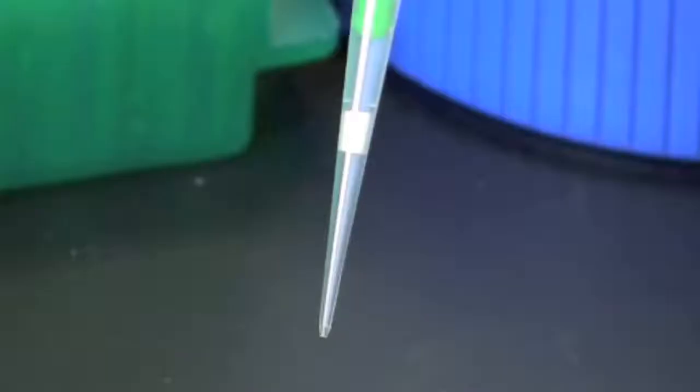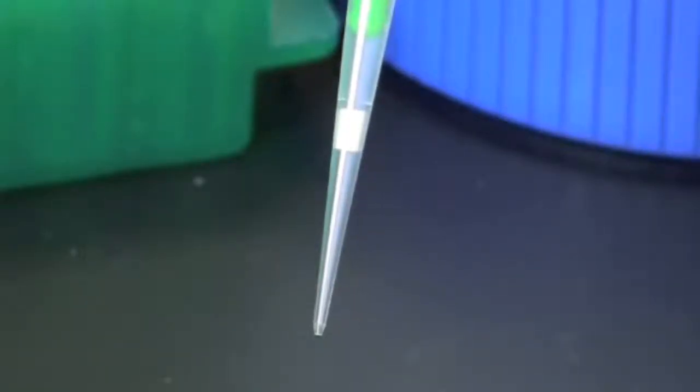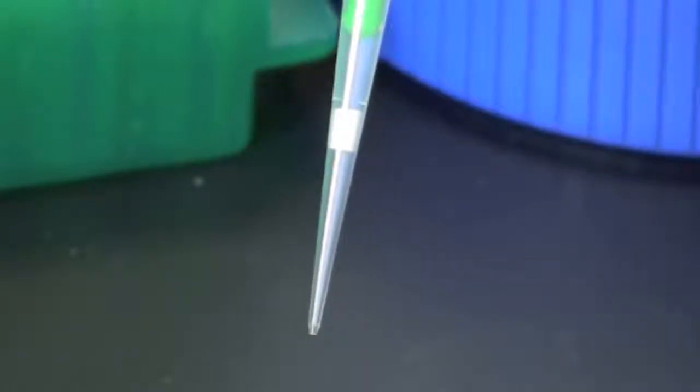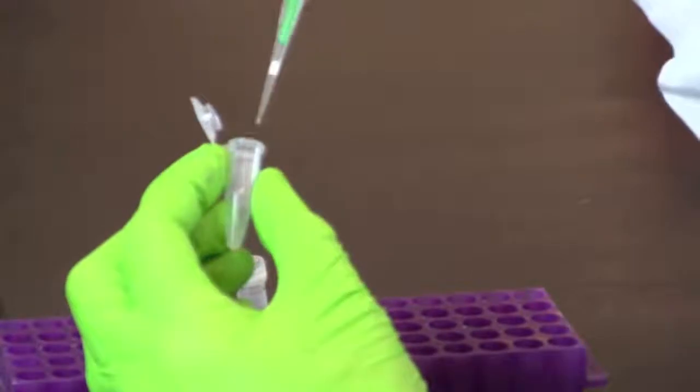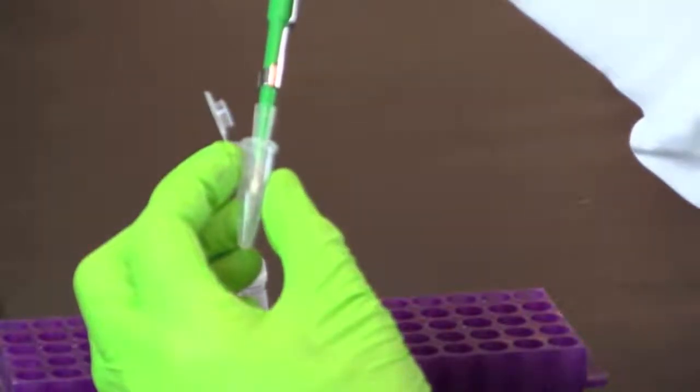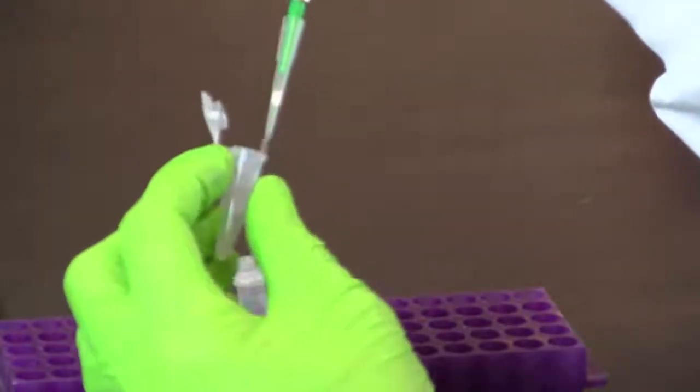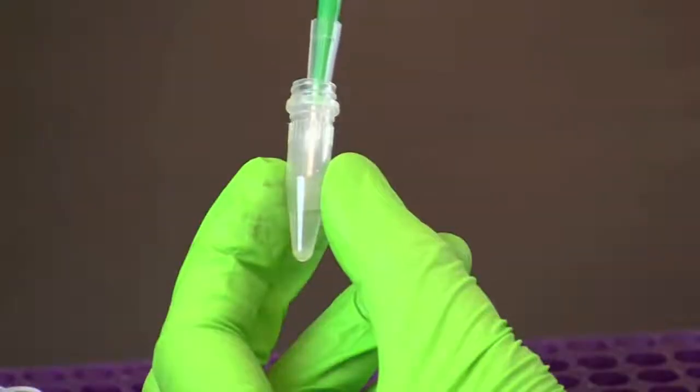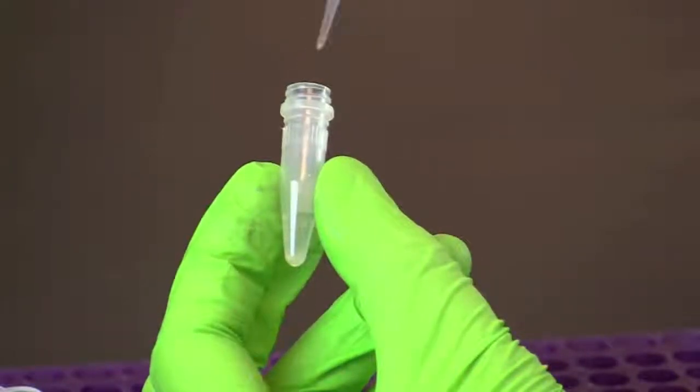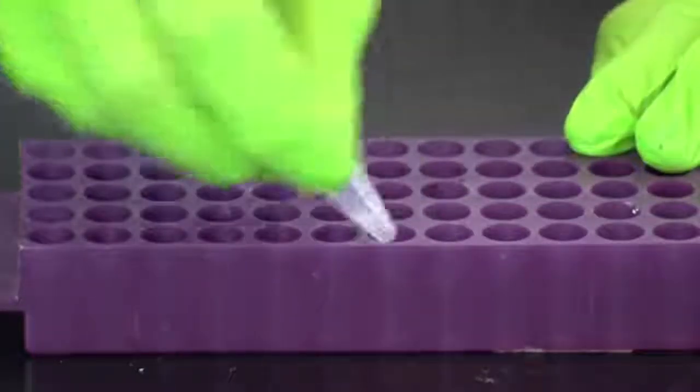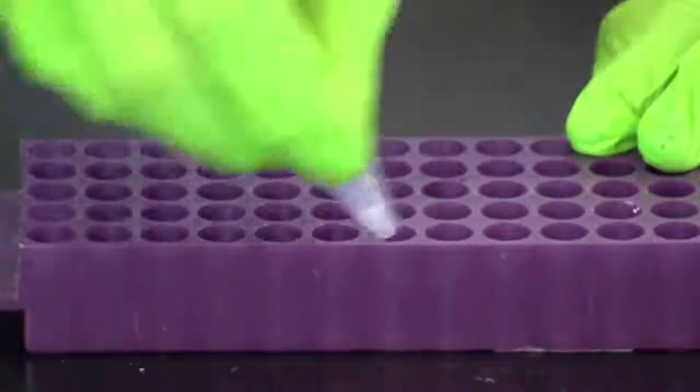Set your micropipet to 20 microliters. Always use aerosol barrier tips when setting up PCR reactions to prevent transferring aerosols from the pipette to the sample. Transfer all of the resuspended cells to a screw cap tube containing instagene matrix. This may require multiple transfers. Screw the cap on tightly and vortex or shake the tubes.